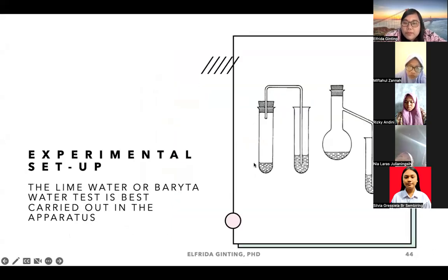So here, you mix the carbonate with hydrochloric acid. It will form carbon dioxide, right? The carbon dioxide will go through this pipe going through here. At first, a precipitate of calcium carbonate will be formed, right? But over time, the hydrogen carbonate of the calcium will be formed.